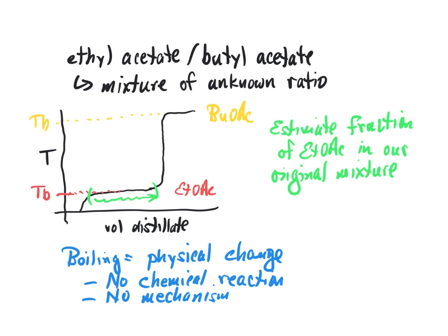Okay? So make sure you read the complete laboratory procedure. Know how to put together either the simple or the fractional distillation. So you'll need to write out both of those as new equipment.